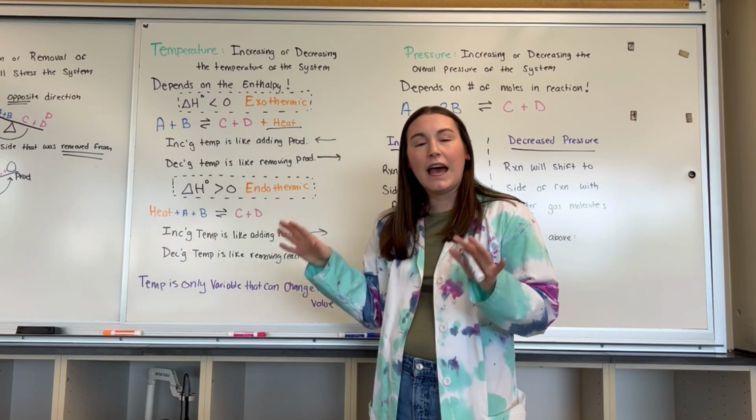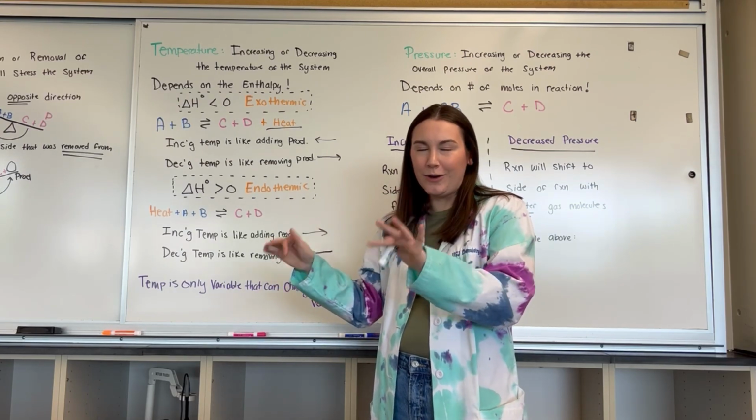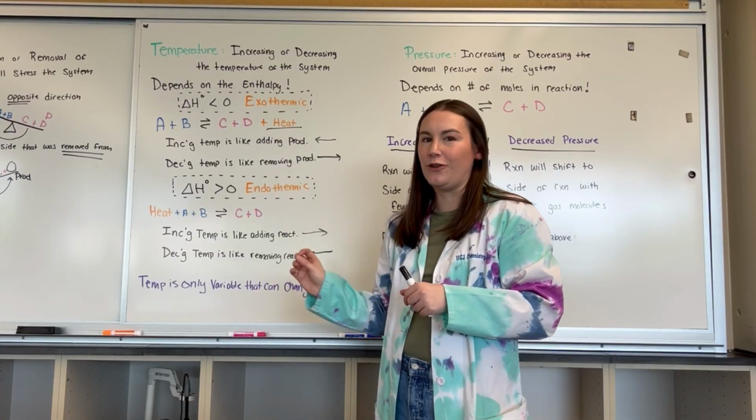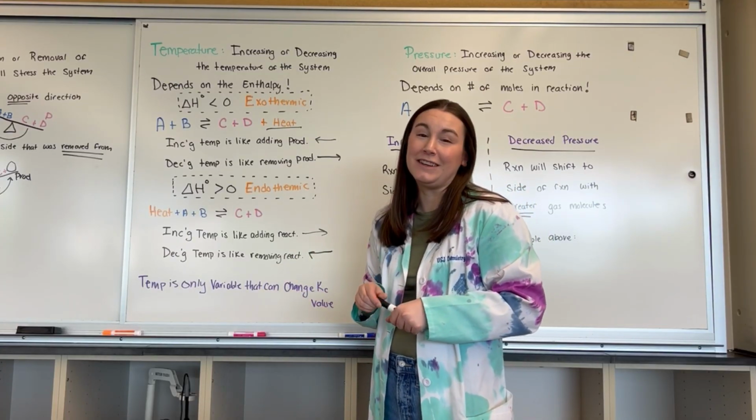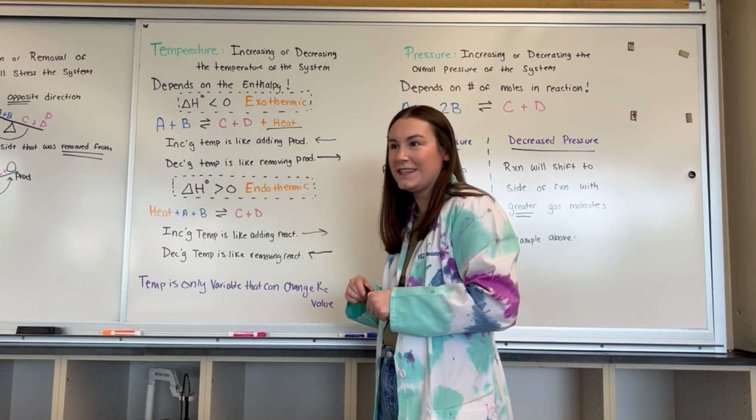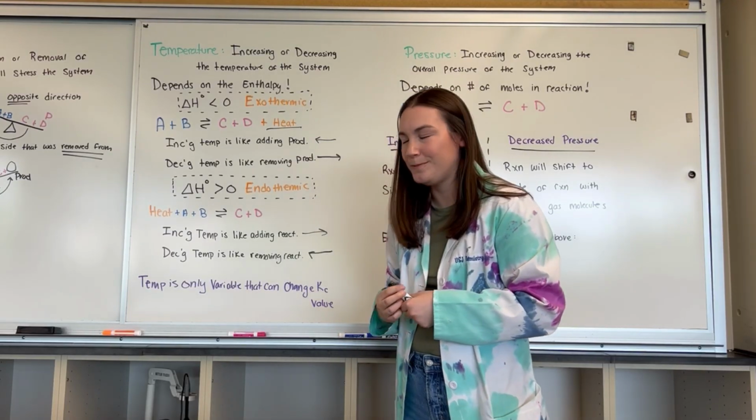We're not going to be looking at that specifically quantitatively in this lab, but it is important to note that temperature is the only variable that will do that, and you'll definitely explore equations more in your lecture course on how that variable can change.